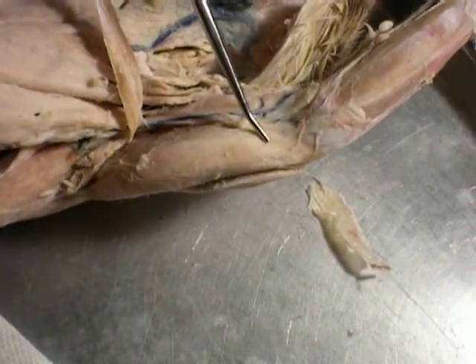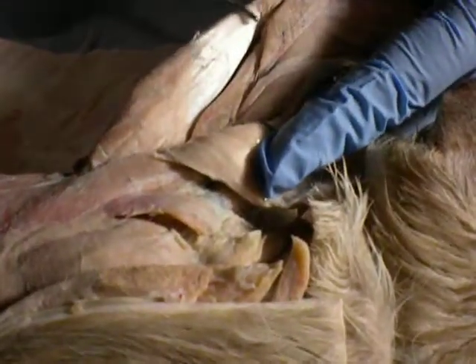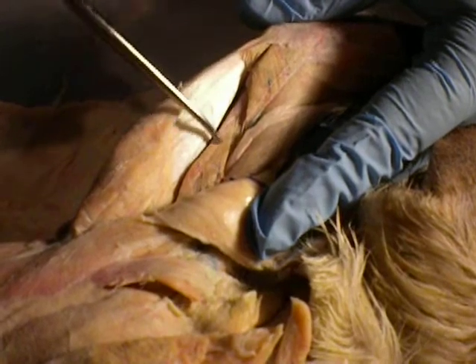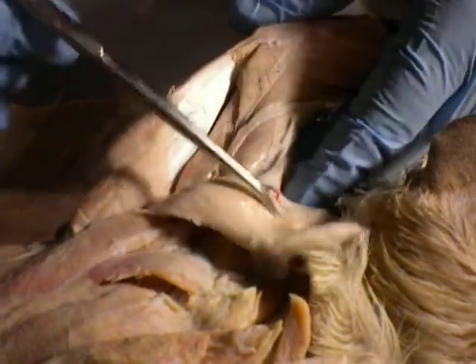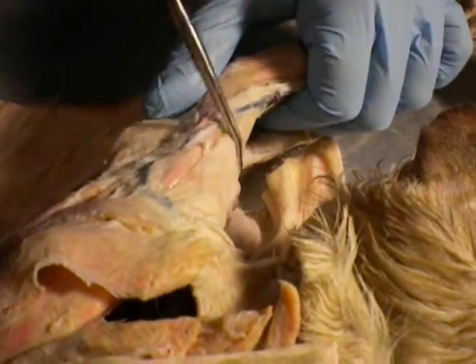Triceps brachii. Lift this flap up. This is also triceps brachii. This is the brachialis, right here in the middle. Don't forget to lift that flap up. This is also the clavobrachialis.